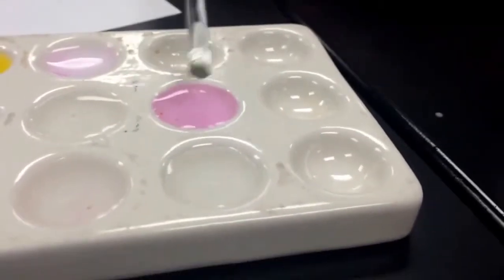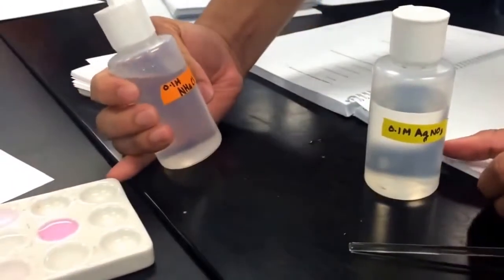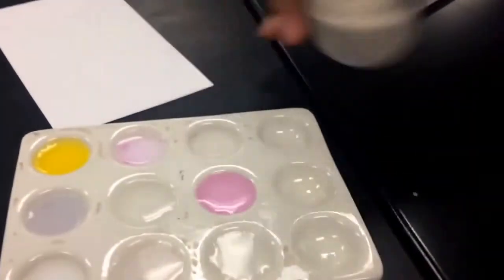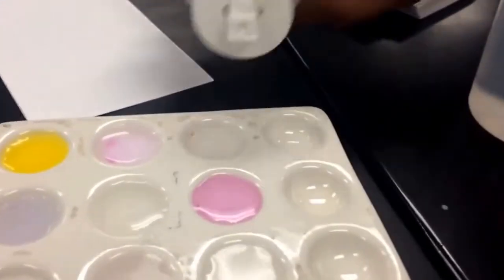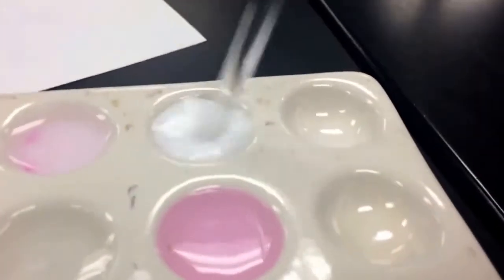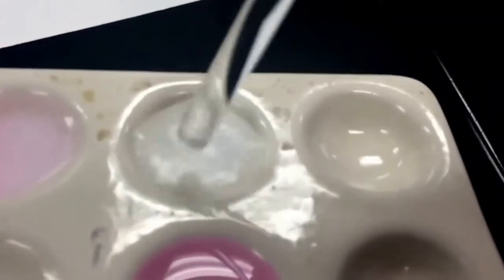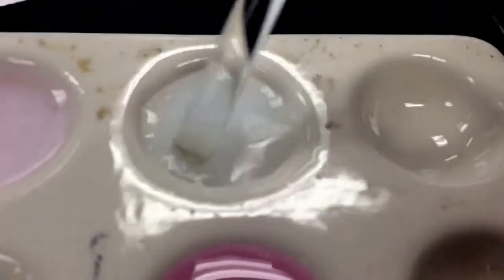It looks clean. We are going to mix for number 9 ammonium chloride and silver nitrate. Here's ammonium chloride. And silver nitrate. It looks milky. Oh, there's a lot of precipitate there. I think you can probably see that in the camera. Yeah, lots of clumps. It's right there. Lots of clumps.